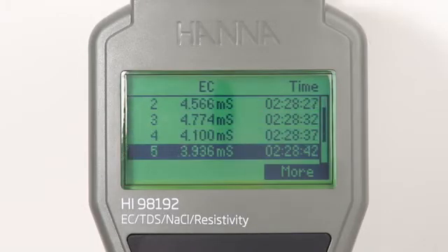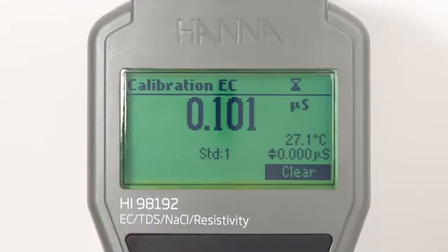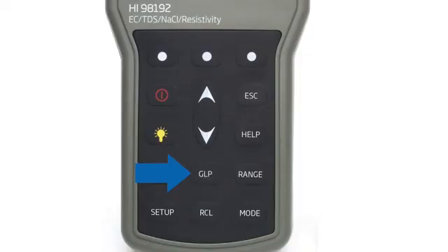Pressing the dedicated Cal button allows users to enter automatic calibration. Up to 5-point calibration can be performed with a choice of 7 memorized standards. Calibration data is stored upon exiting and can be reviewed by pressing the GLP button.